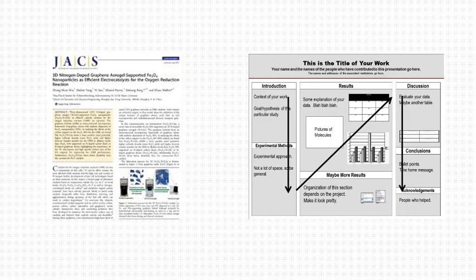And when I say contextualize, I want you to think about why somebody might have done this. Why would somebody be making these molybdenum compounds? What are they used for? Are they pigments? Are they catalysts? Are they biological molecules? And then I want you to write your paper as though synthesizing this complex was part of a research program, your research program.